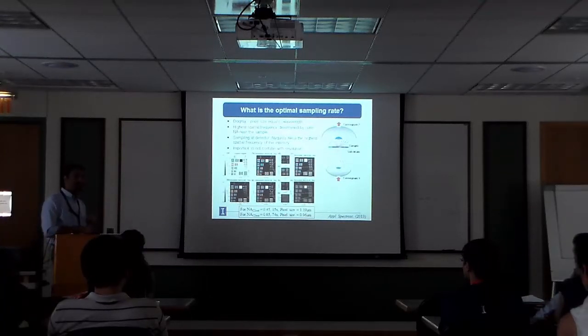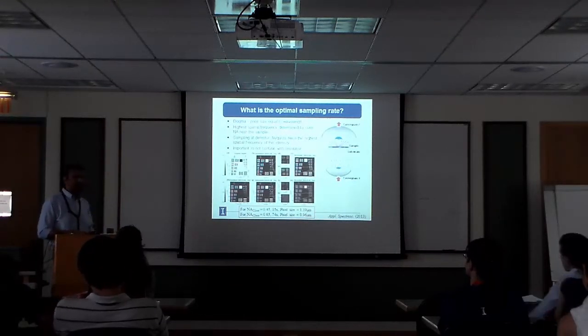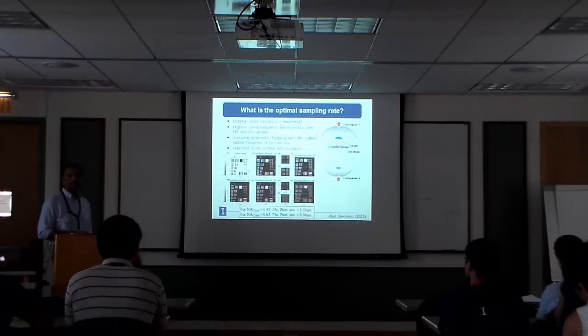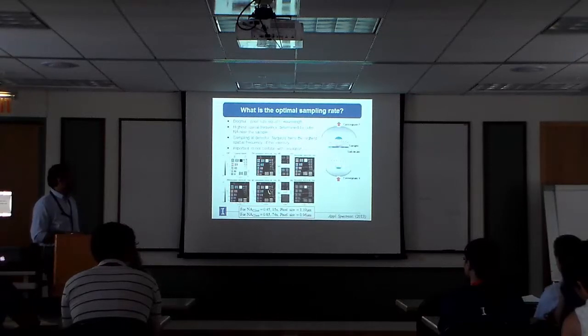So what you're seeing here is midway between hardware advances and the software advances needed to do super resolved spectroscopic imaging. So that's where we're headed now. The hardware is implemented. This is now commercially available from at least Agilent, and I think PerkinElmer will introduce it later this year. But now you can do what is called high definition IR imaging now, just for the heck of it.